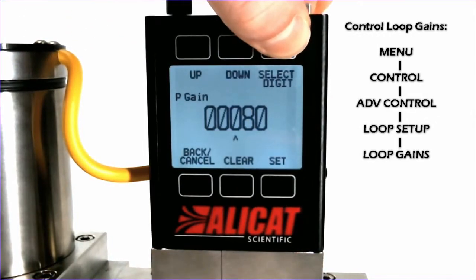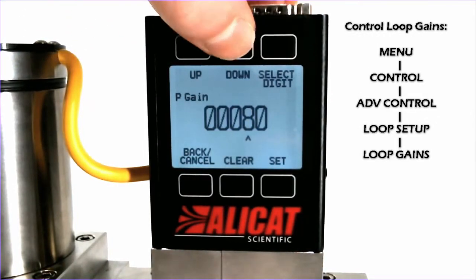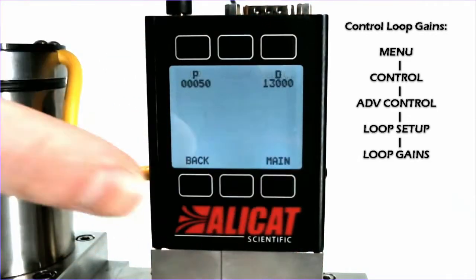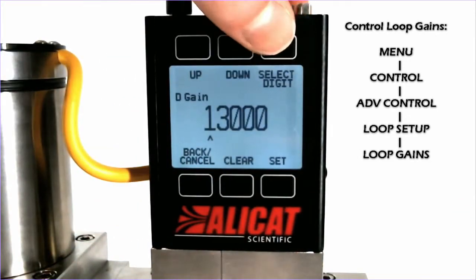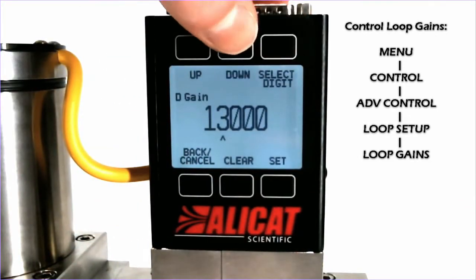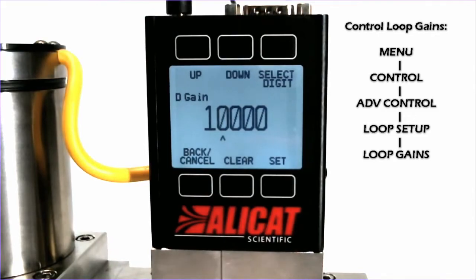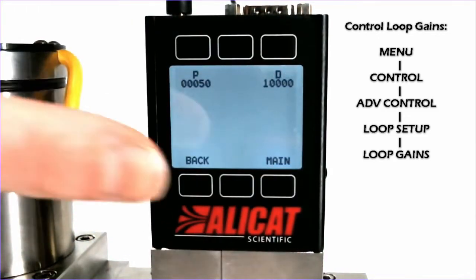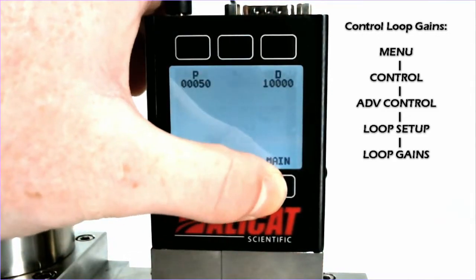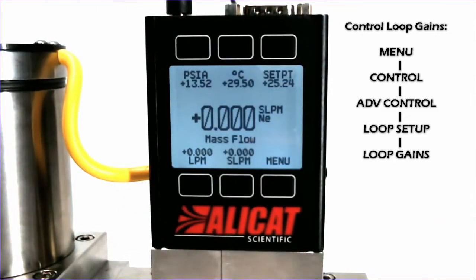Say we want to change P to 50, hit Set, and D to 10,000, and hit Set. And that is how you properly adjust the PID tuning on an AlleyCat device.